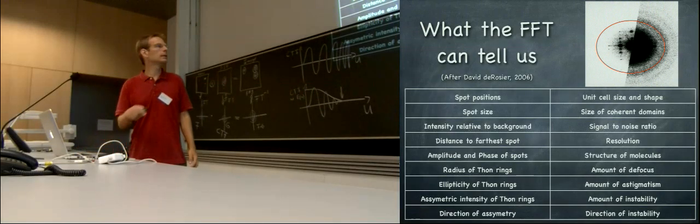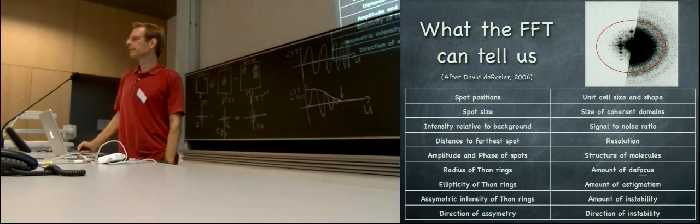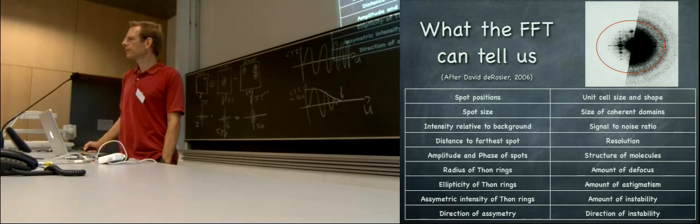Okay, DQE here, resolution dependent DQE. Yeah, okay. You're right. Yes, exactly. You would have to know it at the resolution range.